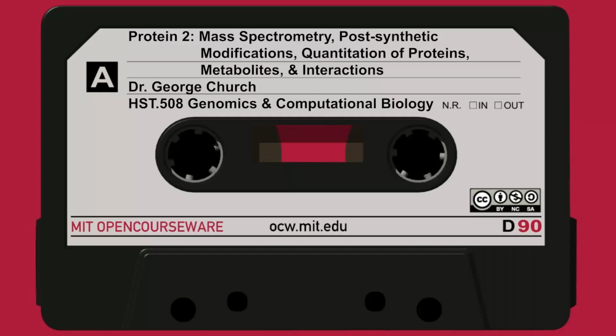And then, so that's the first dimension, is horizontally, sedimentation. At the very top axis going horizontally is sedimentation. And then going down is SDS gel electrophoresis. So now you're taking these native complexes and breaking them up into their component proteins, and where high molecular weight is up, then low molecular weight is down. And you can see that there are quite a number of proteins in each of these two subunits, the 60S and the 40S. Now each of these proteins, so that's the second dimension.